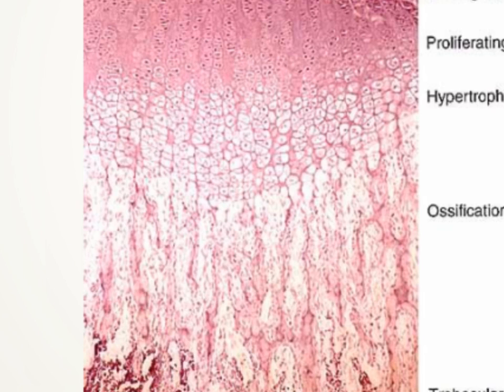After some time, these irregularities will be removed and the osteoblast will form concentric lamellae of compact bone, and complete ossification and complete compact bone formation will take place. So this area is the resting, this is the proliferating, this is the hypertrophied, and this is area in which we have spicules or trabeculae of spongy bone is called stage of spongy bone formation or ossification.